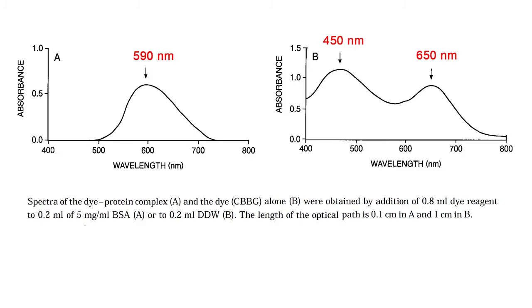In the modified new Bradford method, absorbances of standard protein solutions are measured at two wavelengths, 450 nanometers and 590 nanometers. Then the ratios of absorbances at 590 nanometers to 450 nanometers are calculated for standards. This ratio indicates the reduction of the reagent concentration and production of the colored complex. The protein standard curve thus obtained is linear, resulting in correct protein measurement of the sample.